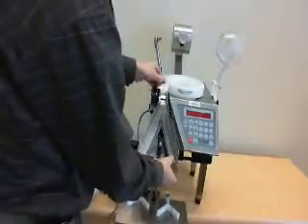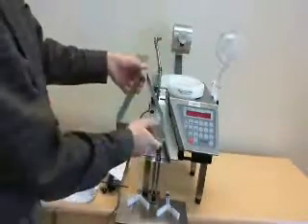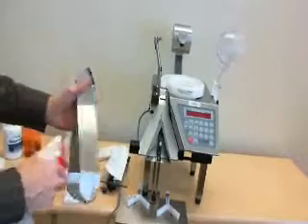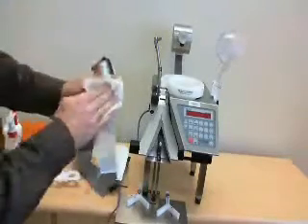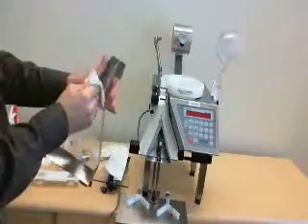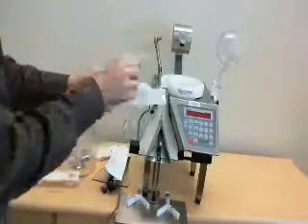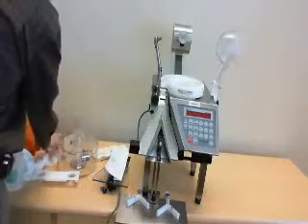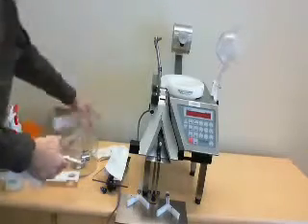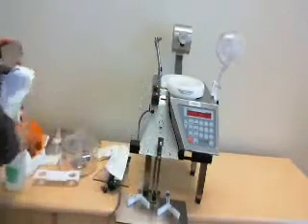And now the stainless steel compartment, the stainless steel slots. Notice that there are tabs. You never want to force the stainless steel parts in or out. Gently finesse them and they will come out easily. You just don't want to bend them to the point where they're not being held snugly in place. Clean and dry as you go. And finally, removing this piece.